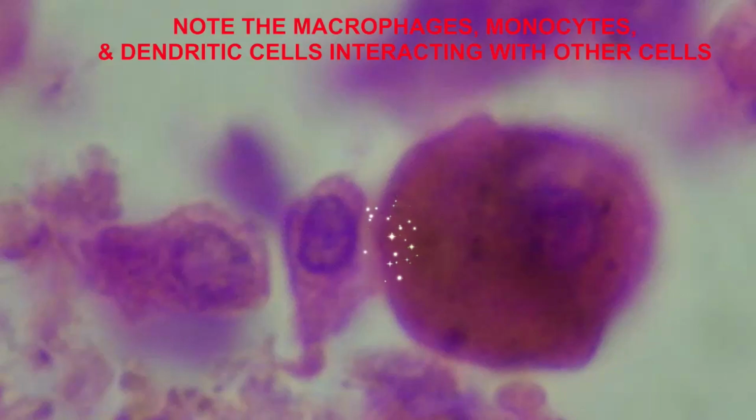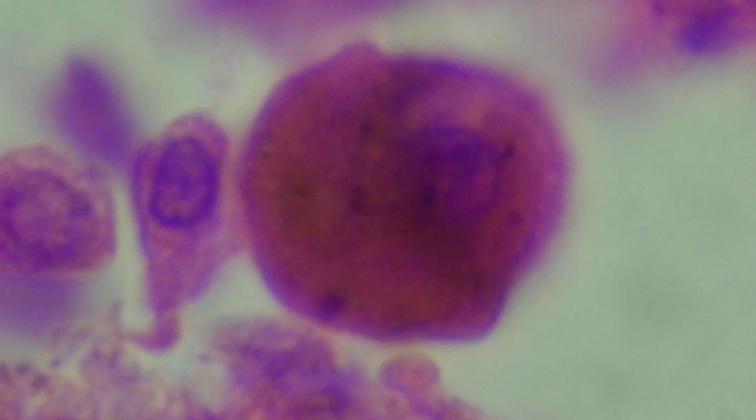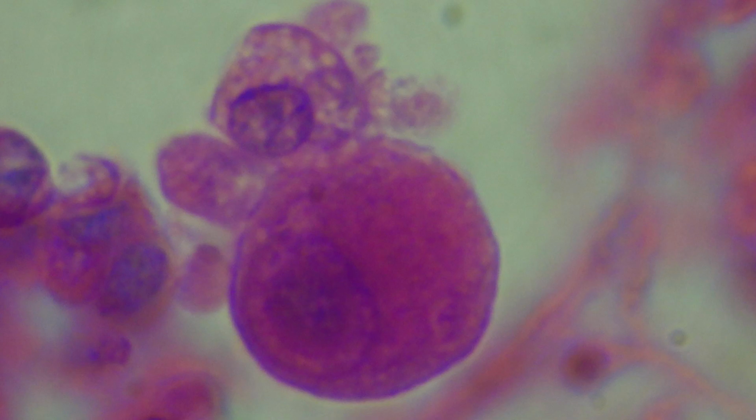And in these images, you can see that there are a number of body cells which are contacting these large cells, whether they be macrophages, monocytes, or dendritic cells, and presumably they are communicating with local hormones in these images.